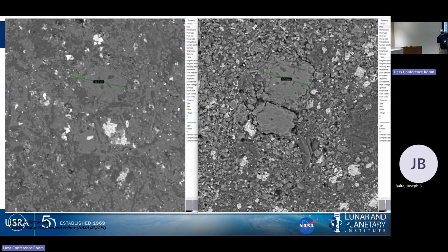Which one is more porous? This one, right? Is that porosity real? We think it probably is. This is coming from a chondritic meteorite. There's probably some amount of porosity in between the grains of these things. When we just polish this up by hand, we get a great image of all these. We get a nice cross-section of everything. We are potentially losing a detail.